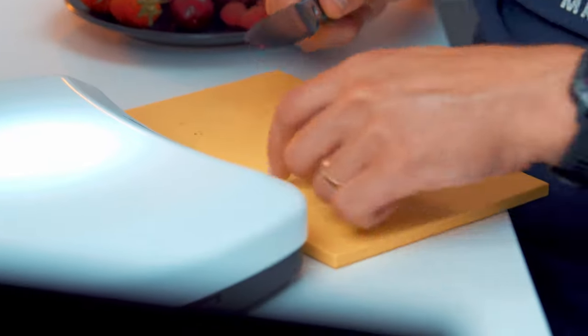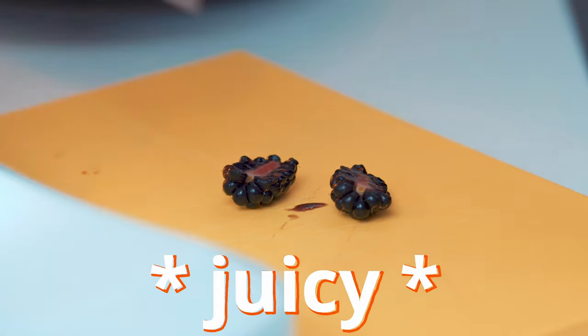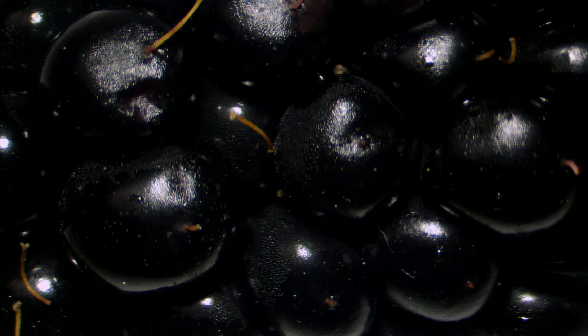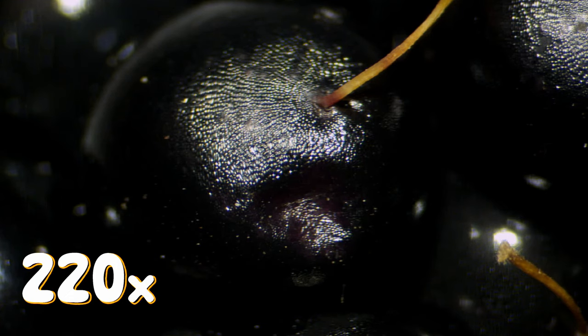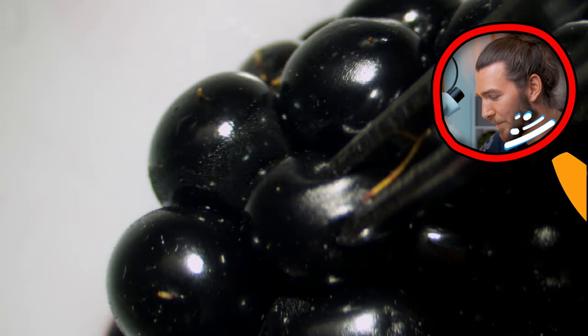Moving on to the next berry — let's take the blackberry and cut it in half. This one's juicy. You can see some whiskers here too, but they're a bit different. On the blackberry the whiskers come from the center of the berry itself. It's a lot of small berries, and this is connected to the seed inside.